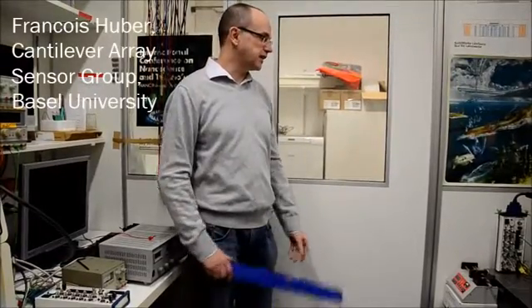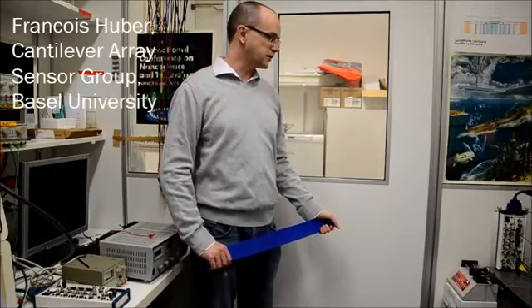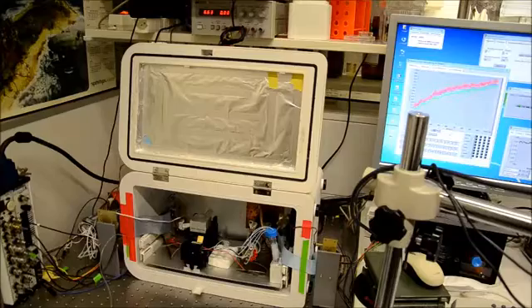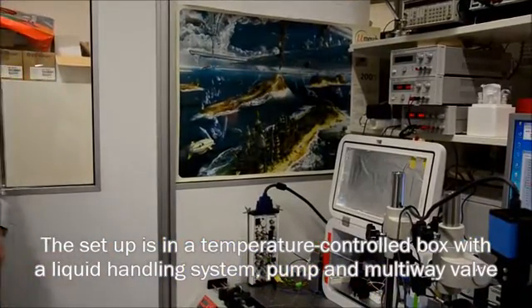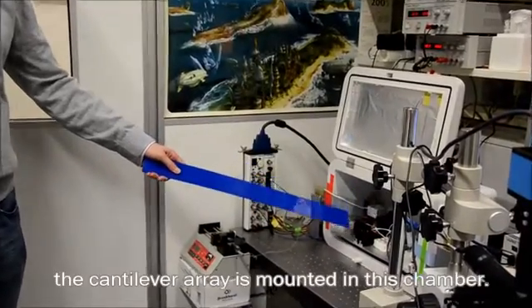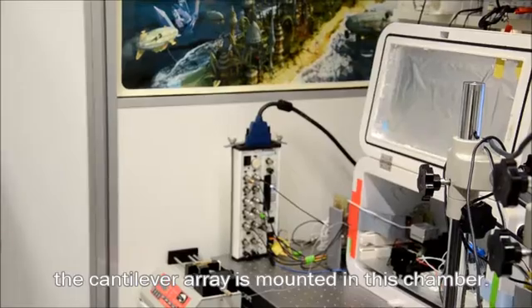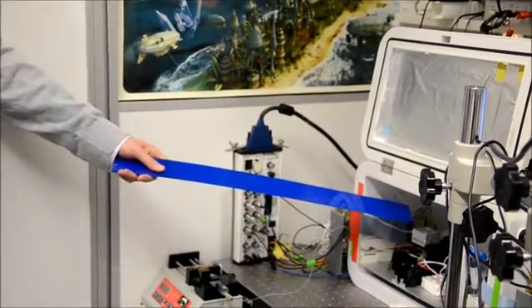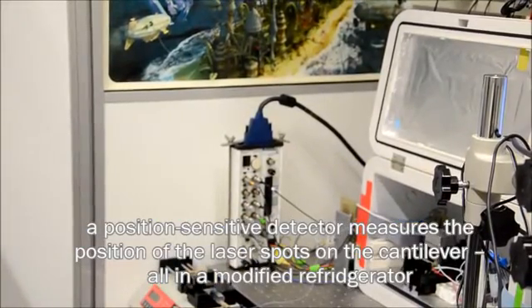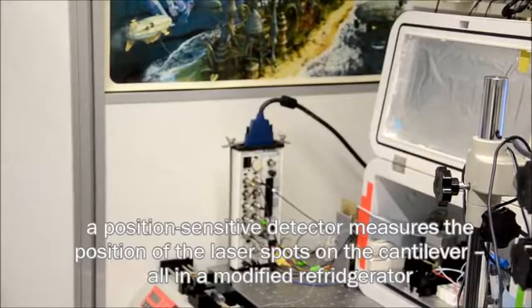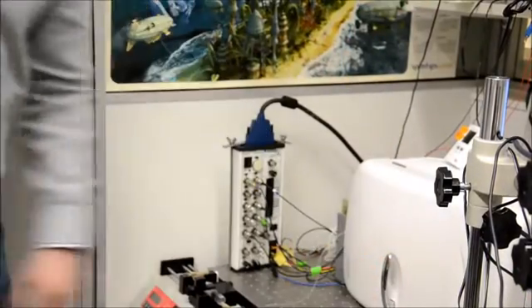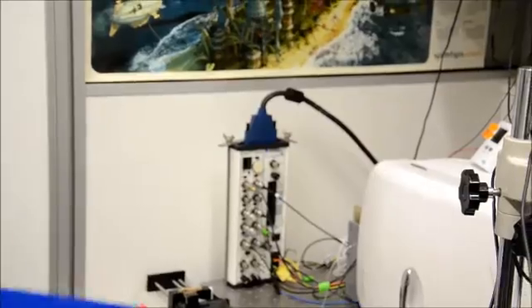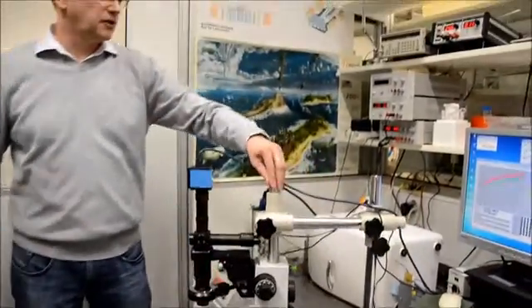I'd like to show you the equipment we use to do our measurements. We have here the setup with a temperature controlled box. We have the liquid handling system here with a pump and a multi-way valve. Then here is the actual device with a liquid handling chamber. The cantilever array is mounted in that chamber. And then here is a position sensitive detector to measure the position of the laser spots on the cantilever. And we can close it. It's a modified refrigerator we use.